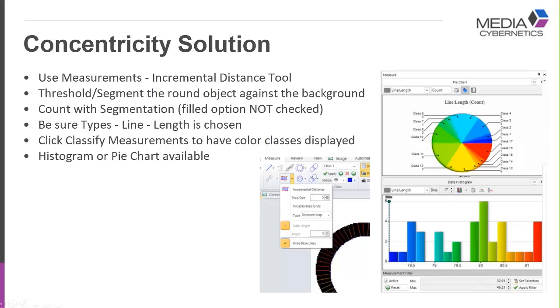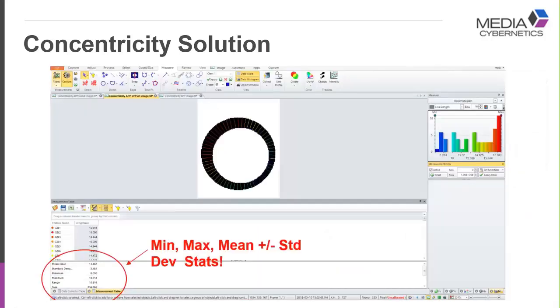It gives you a nice color spectrum distribution, and we can look at a histogram, a pie chart. This is an example of a test sample where you can see the inside diameter is different and it's also shifted out of place.